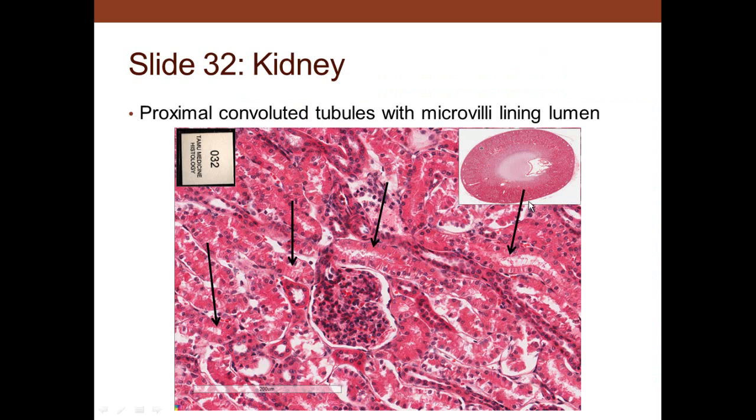If you look at where that little box is there, the box is illustrating what we're seeing on the overall specimen. So if you look right there, we're looking in the cortex. In the cortex, we have the renal corpuscle. We have lots of proximal tubules. Most of those here are proximal tubules. However, we do have a distal tubule that goes through there occasionally, that we see a distal tubule as well. But in preparation of the specimen to see it, you can see the magnification. This is the identification.